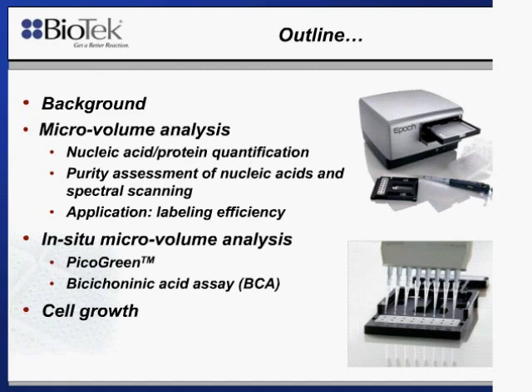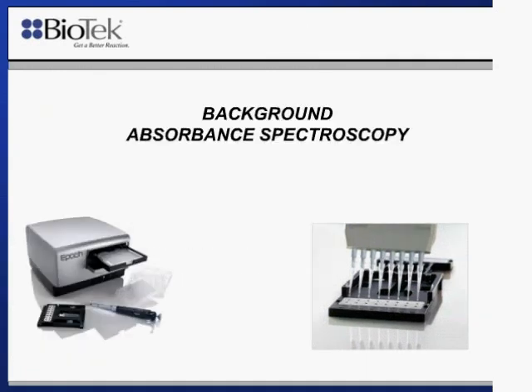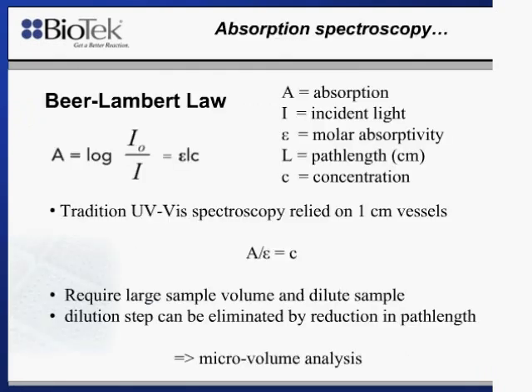So starting with background, first I'd like to discuss absorbance spectroscopy, and many of you will be familiar with this. We'll have a quick discussion here on the Beer-Lambert law. Most folks are familiar with the use of UV spectroscopy, and traditionally that has relied on the use of a 1 centimeter vessel.